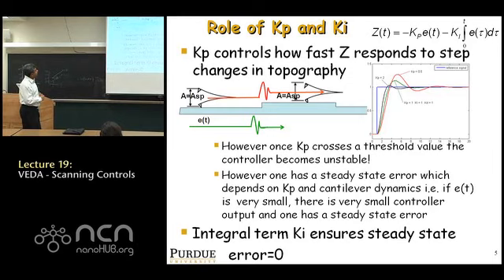You have this, on the left of the scan, amplitude equals set point amplitude, right? Everything is stable. You're scanning a surface, and the error signal will be 0, right? Because the amplitude is equal to the set point. So the error signal is 0.